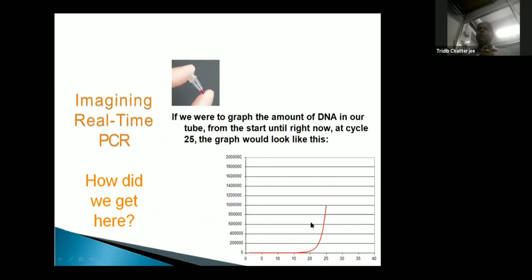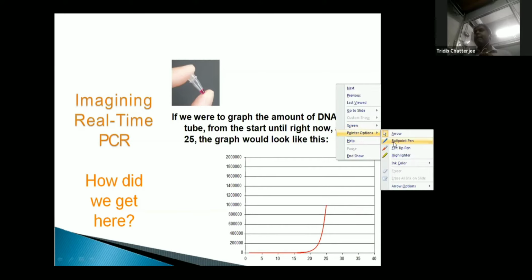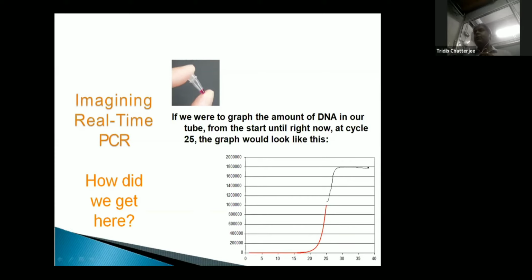And I think those who have seen real-time data have all experienced this. Starting from cycle 0 or the first cycle, up to a cycle of say 15, 16, 17, 18 here, or it may be extended in some cases, up to a certain number of cycles the curve is flat. That means as if there is no amplification. And after that, we suddenly see an exponential amplification, and that also lasts only for a few cycles, 3, 4, 5 cycles. And after that also, we will see a flat curve. So exponential amplification we can only see for a few cycles. Before that the curve was flat, then it starts amplifying, the amplification persists only for a few cycles, and after that it goes flat again.